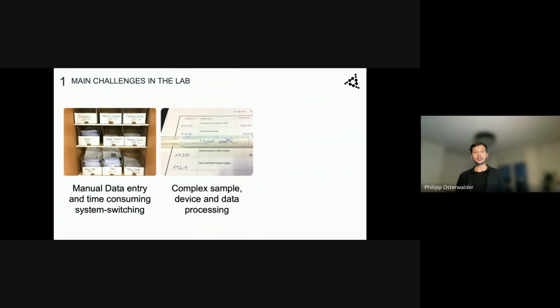Another point is heavy system switching. There is a bunch of different tools a lot of lab technicians have to use today. It's not only paper and Excel spreadsheets; there are the ERP system, the MES system for production, maybe some status information in the logistics system, or some Access database, or a QMS system, whatever. You name it and know what I mean.